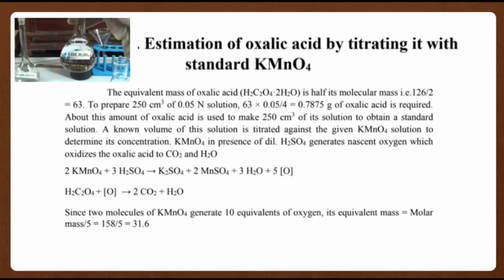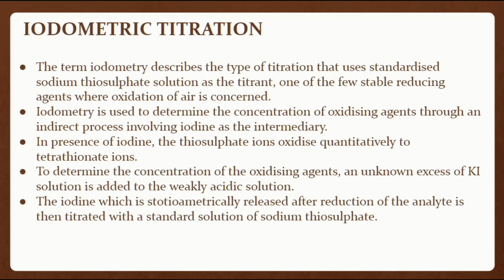KMnO4 releases nascent oxygen in the presence of a mineral acid. Nascent oxygen is a highly reactive species which actually oxidizes the given oxalic acid. The endpoint is indicated by the appearance of a pale permanent pink color. The titration is repeated for concordant values.